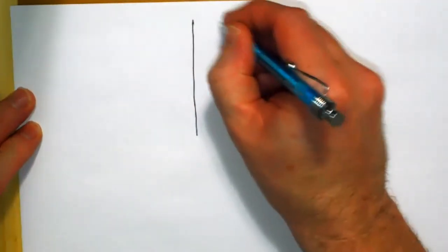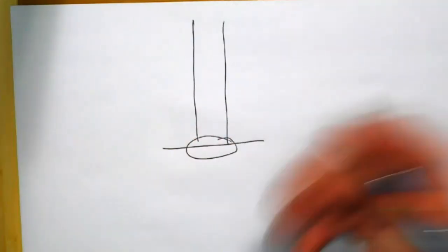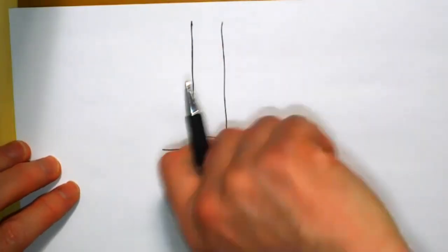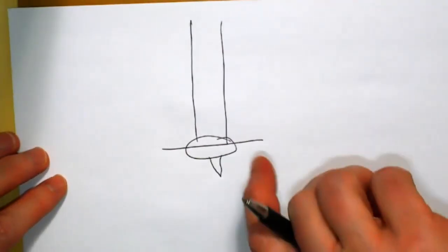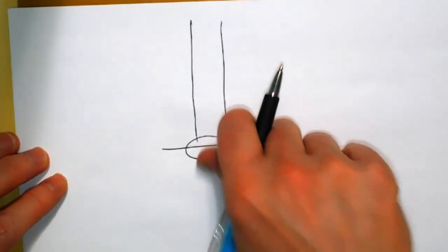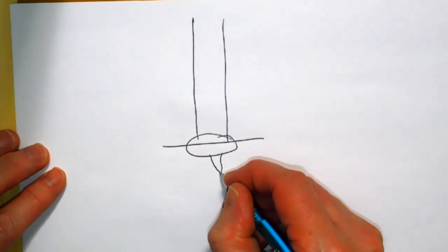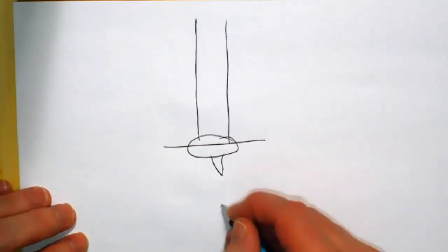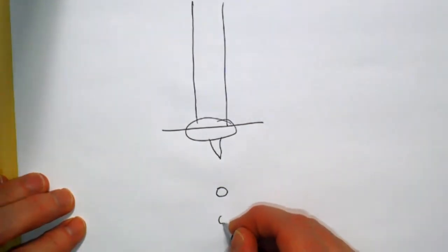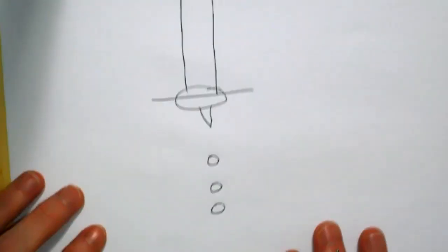So here's a bigger burette and a stopcock. And people have different ways to do a little bit of, hey, it's crooked. All right. So the stopcock lets the solution out. Some people like to do additions by spinning it. Others like to turn it just a little and let a drop build up. So let's look at that situation. So a free falling drop is going to be about the same size every time. So if I set it to drip, the volume once it free falls is about the same over and over.